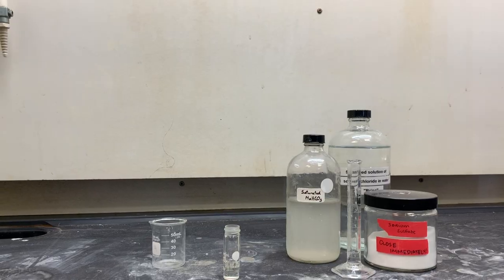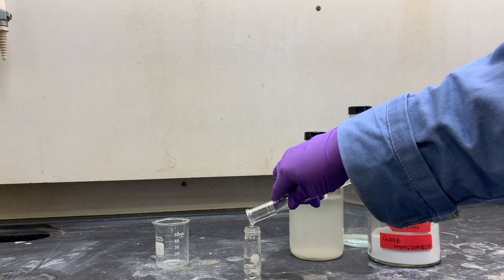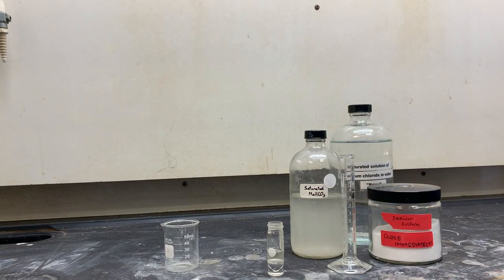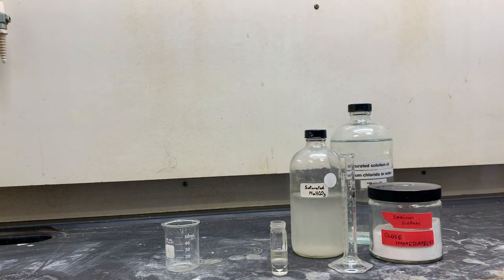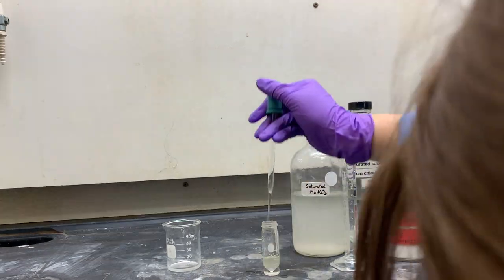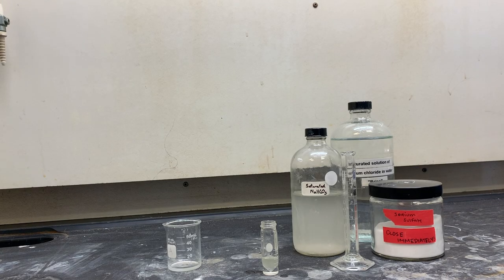Perform an extraction of the residual HCl by adding water. After mixing, remove the lower aqueous layer. Wash the organic layer with saturated sodium bicarbonate, then wash again with brine. Dry over a minimal amount of drying agent.